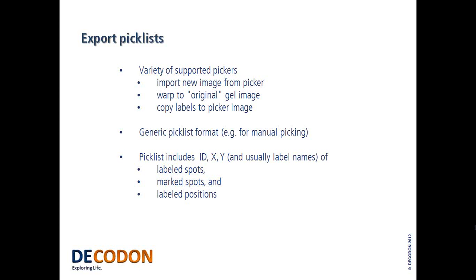You can also just qualitatively analyze your images and then say, I want to pick this spot and that one, and you would then pick them after having just labeled their positions without having a spot detection or even a quantitative analysis done for your images.